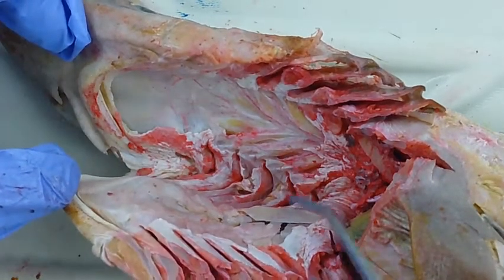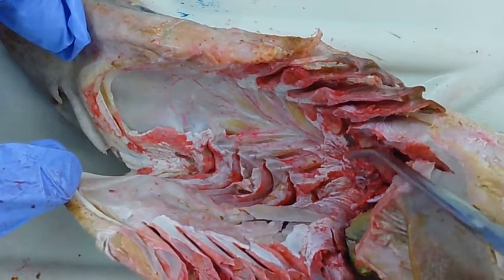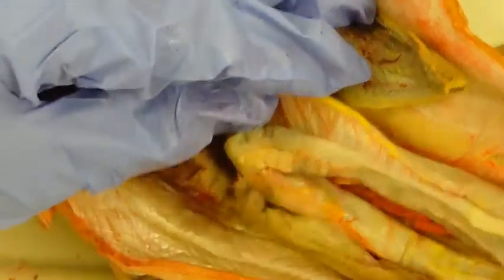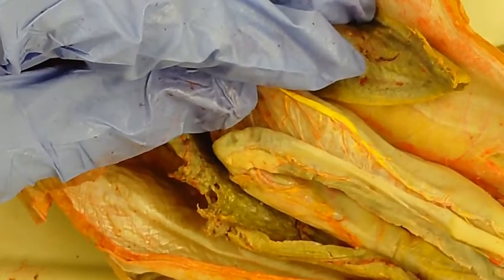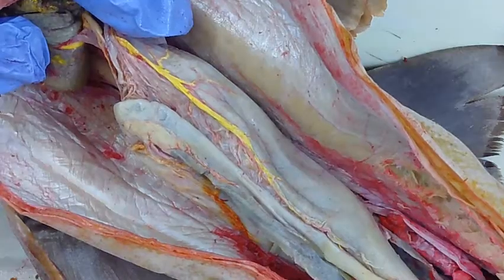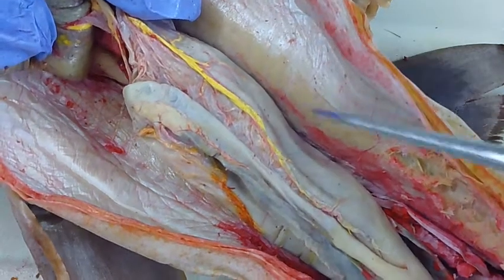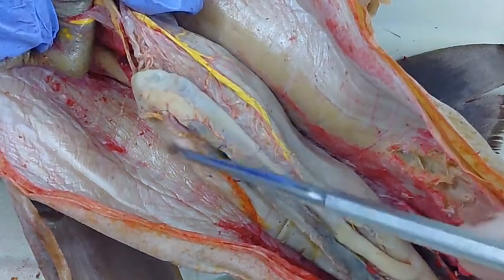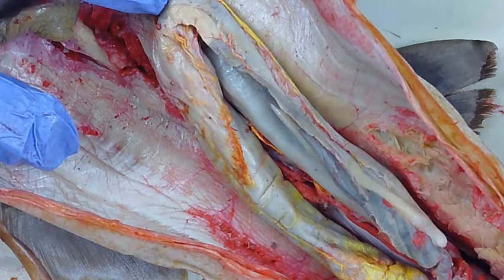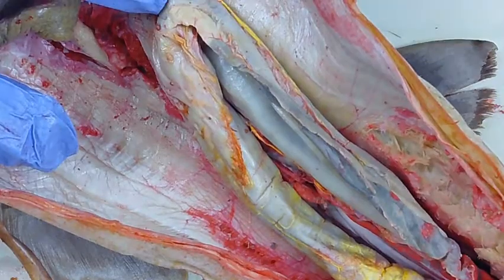Then we have the pharynx, which is the space that extends from the spiracle opening to the esophagus. And then we have our stomach here, which is this S-shaped, J-shaped elongated structure. The pyloric sphincter controls the passage of food from the stomach into the duodenum, which is the very short proximal portion of the intestine. Food then moves into the valvular intestine, which contains a spiral valve.